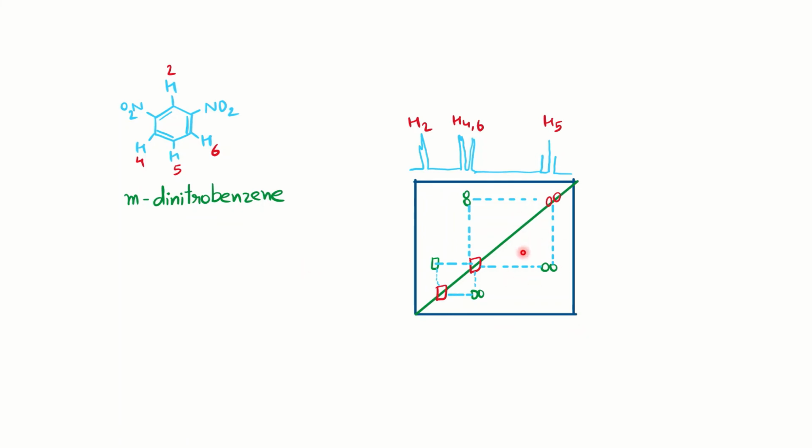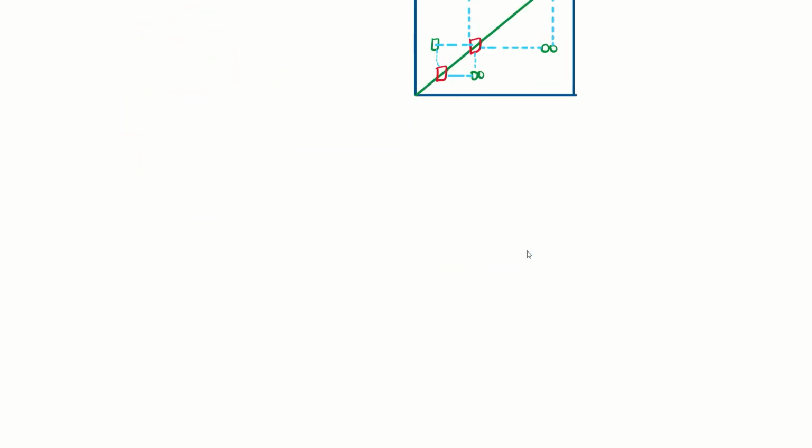by using the 2D NMR. So if you get this question theoretically, for M.Sc students, you can draw the two-dimensional NMR, homo and heteronuclear COSY. Take these examples and explain your answer.